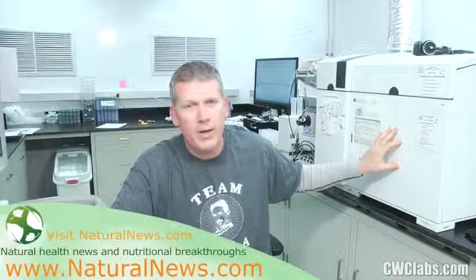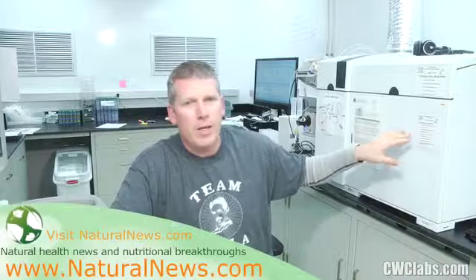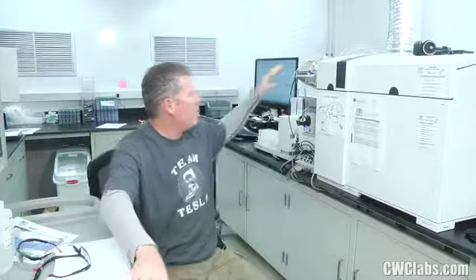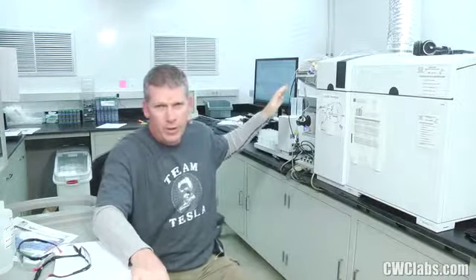This instrument is amazing. This instrument does what it's supposed to do, but it is still based on the laws of physics. There's thermal expansion, for example, that happens during the warm-up cycle. The electronics will change their temperature, and perhaps the voltages that will affect your run. You need things to stabilize. Otherwise, you're not going to get reliable, reproducible data through your entire run. So trust in the instrument, but understand that you have to give it time to stabilize, and treat it with respect by minimizing your sample introduction burden on the system.